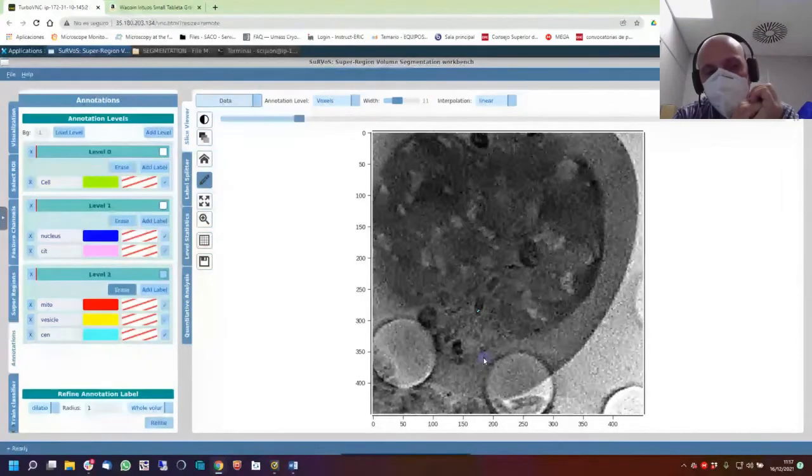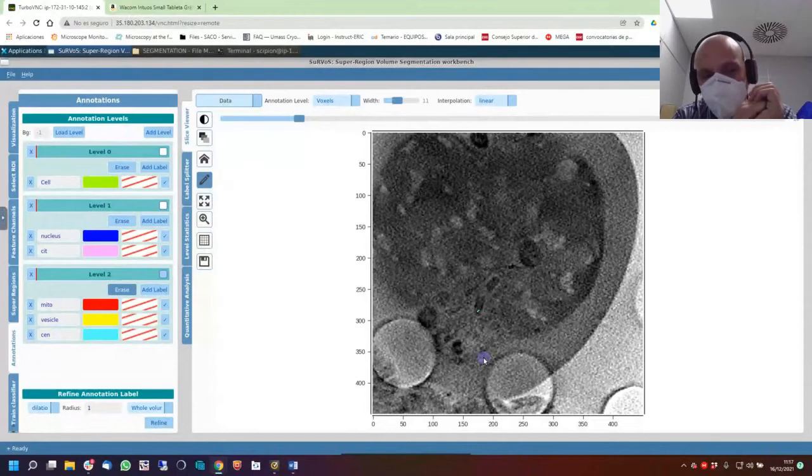But sometimes it's not real because you can assign a voxel to different layers, different labels. Maybe it's the case, but maybe not. But it's a matter of you. So you can use the trick that you want. But I don't understand it quite well.